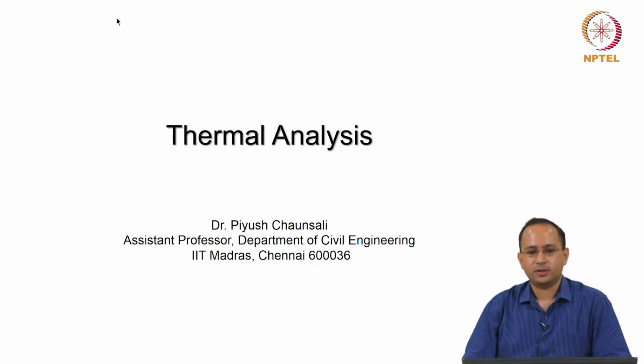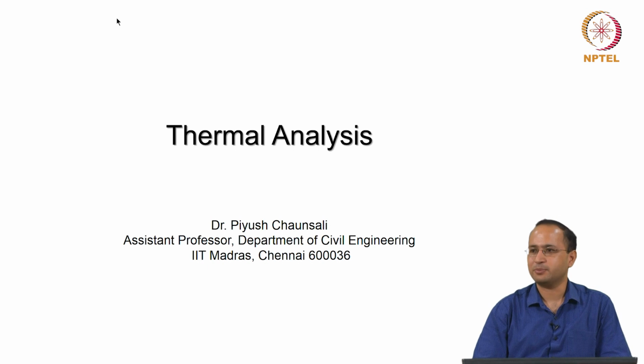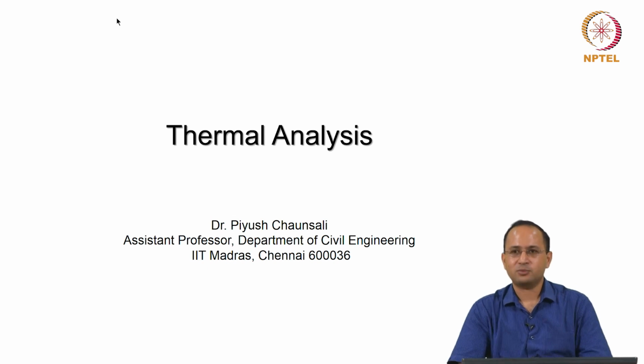Hello everyone. So today we will look at another technique which we commonly use to understand the construction materials. It is thermal analysis, right. So in the next few lectures we will talk about the principles of various techniques which we use, and also we will see application of thermal analysis to construction materials. Okay. So the first question that comes to mind: what is thermal analysis, right?